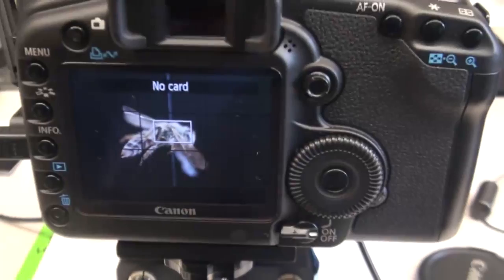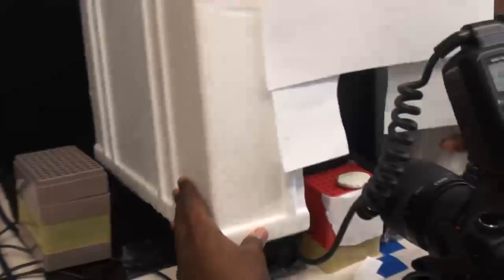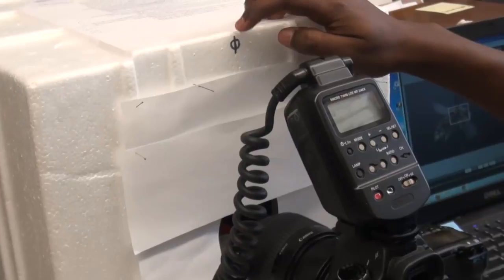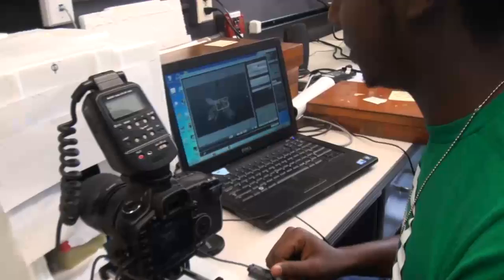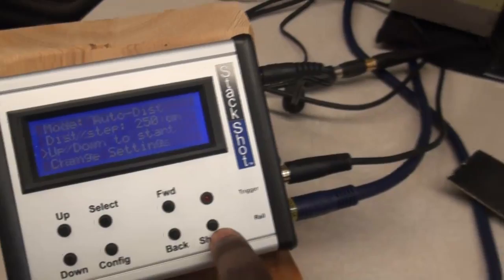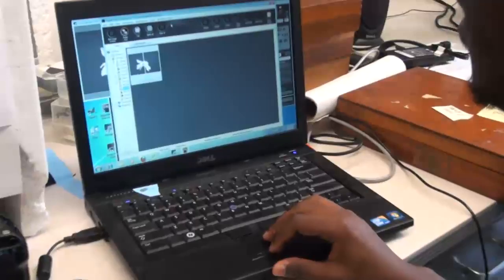In order to do a practice shot, we have to put the lid on, which is Sam's specially designed lid. This lid is designed so that this symbol here, the line that goes straight down, has to line up with this hole right here on the flash. And you want to make sure that it's down center of the box within the camera. So then you press shutter in order to take a practice shot. As you can see, once you press shutter, the picture will come up here.